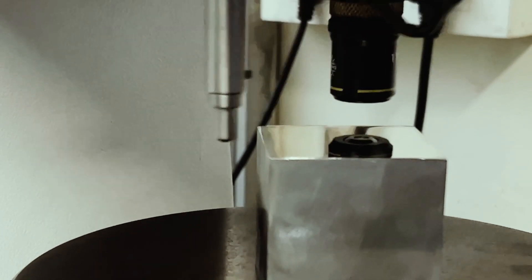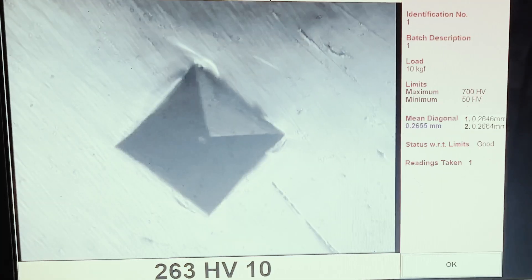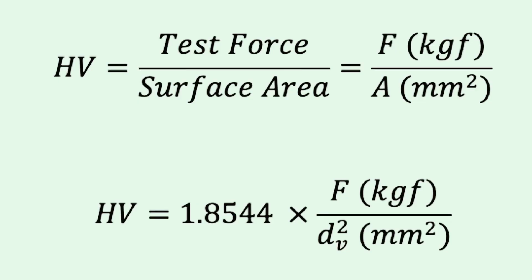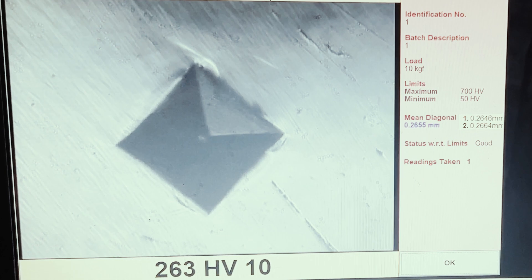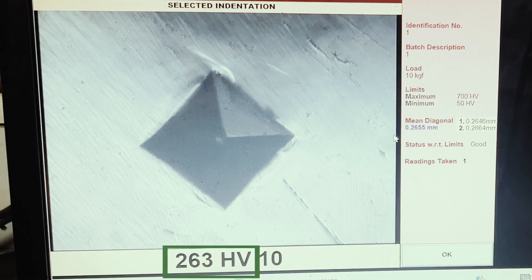The test equipment has a camera through which the indentation is seen. The lengths of the two diagonals of the indentation are measured and the mean diagonal length is calculated. From here the Vickers hardness is calculated using the formula shown. Thanks to technology, this is automatically calculated. The hardness value is reported as a number followed by the symbol HV, denoting the Vickers hardness scale.